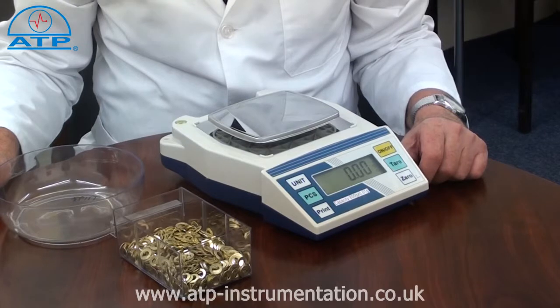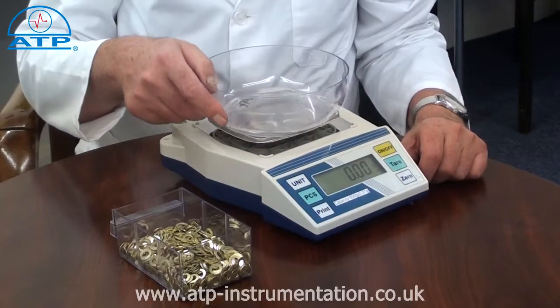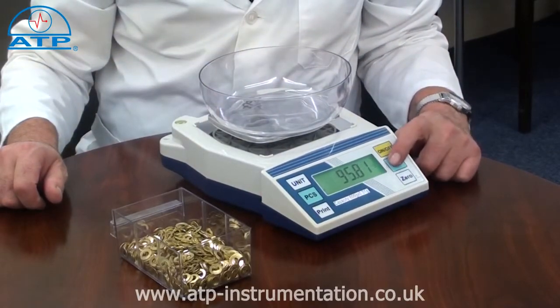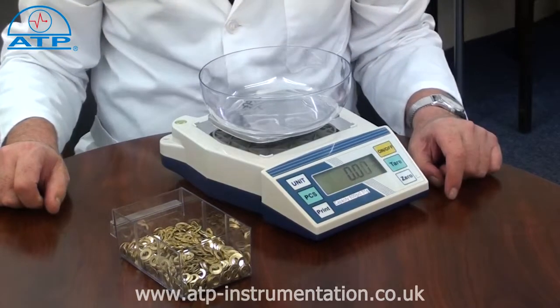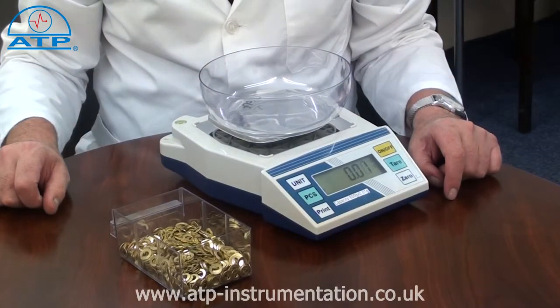Parts counting. This function makes easy work of stock takes. If a container is to be used, this should be tared first. Parts counting is from 10, 20, 50, or 100 sample quantity.